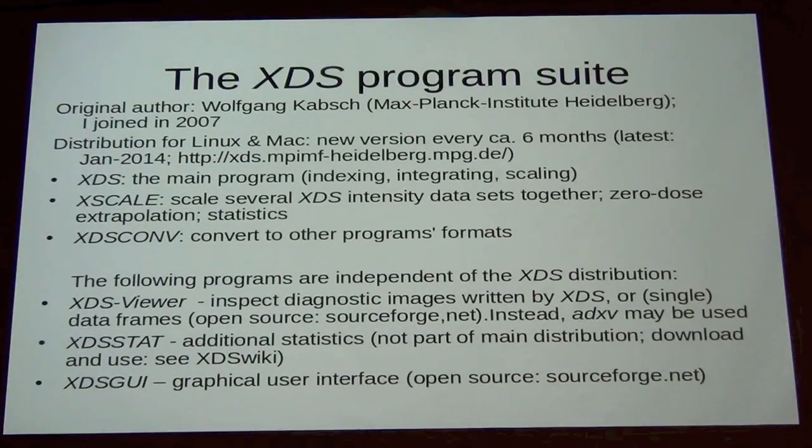So the XDS program package was written by Wolfgang Kabsch. He is at the Max Planck Institute in Heidelberg. He's officially retired, but he enjoys a position where he can still keep working part-time, and he just likes to do research.